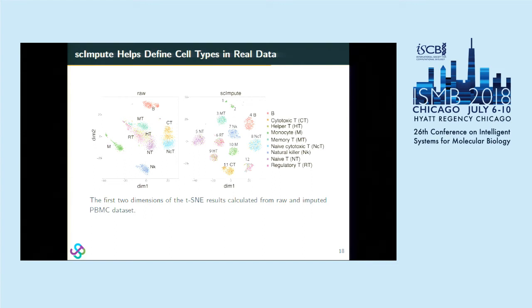So the results I'm presenting here are based on the first 2 dimensions of t-SNE results. With t-SNE, it's not really meaningful to compare the distances between clusters. Usually we only use it to identify different cell populations. If we're looking at the results of principal component analysis, in that case, it may be more meaningful to discuss the distances between cell populations.